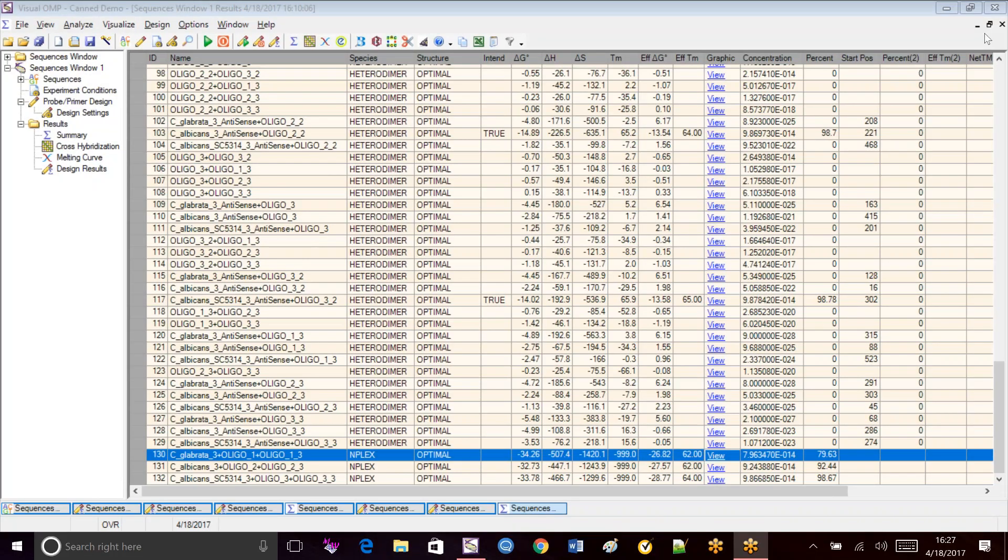Hello and welcome to DNA Software's canned demo. Today we'll be focusing on Visual Ops multiplex troubleshooting.